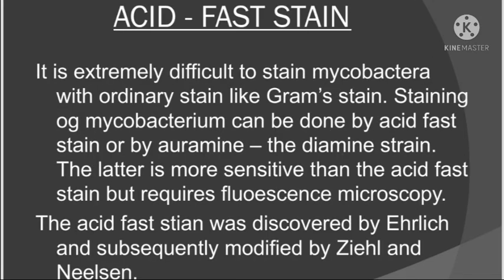Acid fast stain was discovered by Ehrlich and was modified by Ziehl and Neelsen. It is extremely difficult to stain Mycobacterium with ordinary stains like gram stain because it contains lipid, which resists staining. So it can be done by acid fast stain but requires heating.